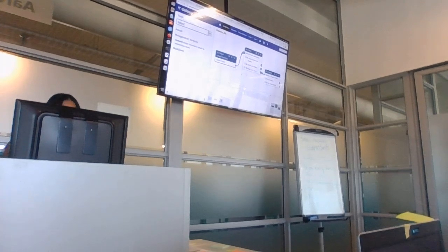You can also use one more in the Galaxy. Okay, so let's pretend that we wanted to add another tool here. After we do the MultiQC, we want to be able to run Kraken on the dataset that was showing us a high GC content.